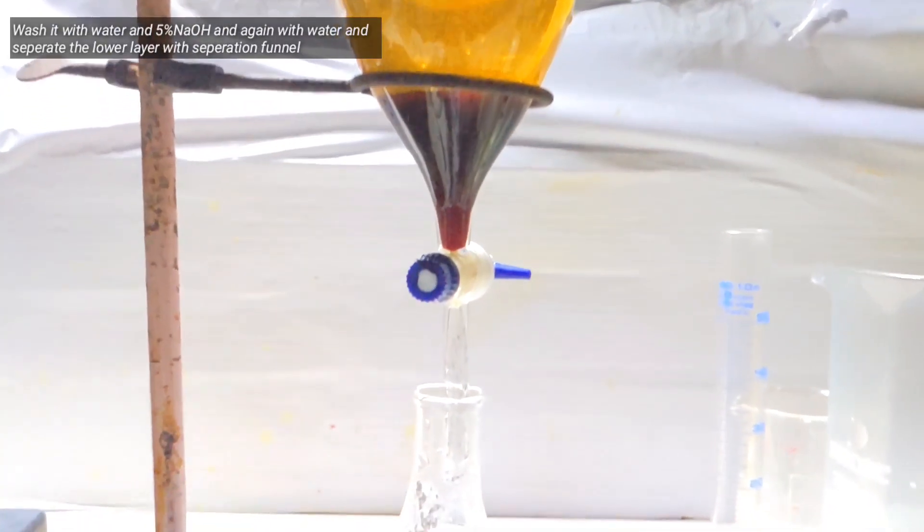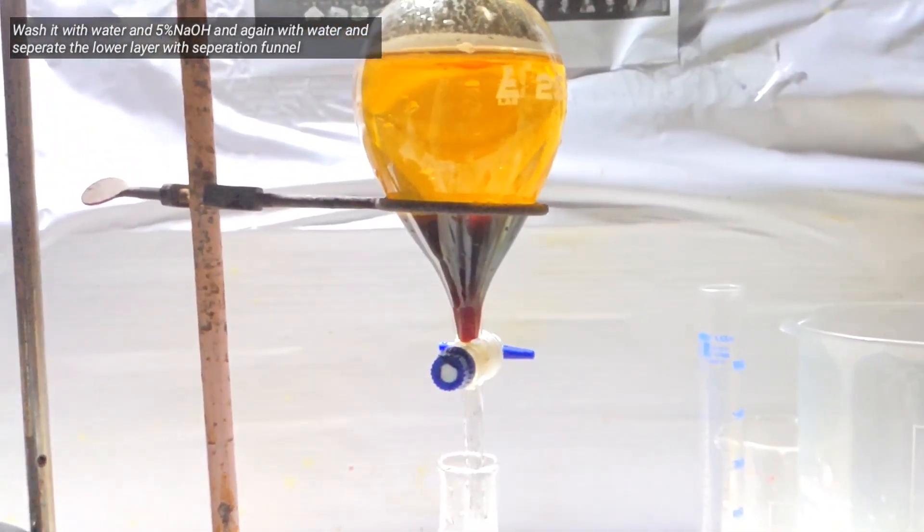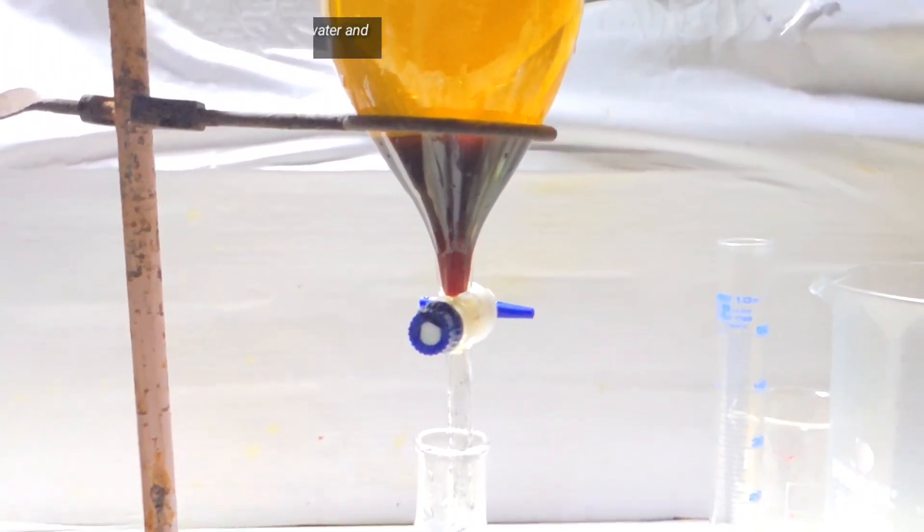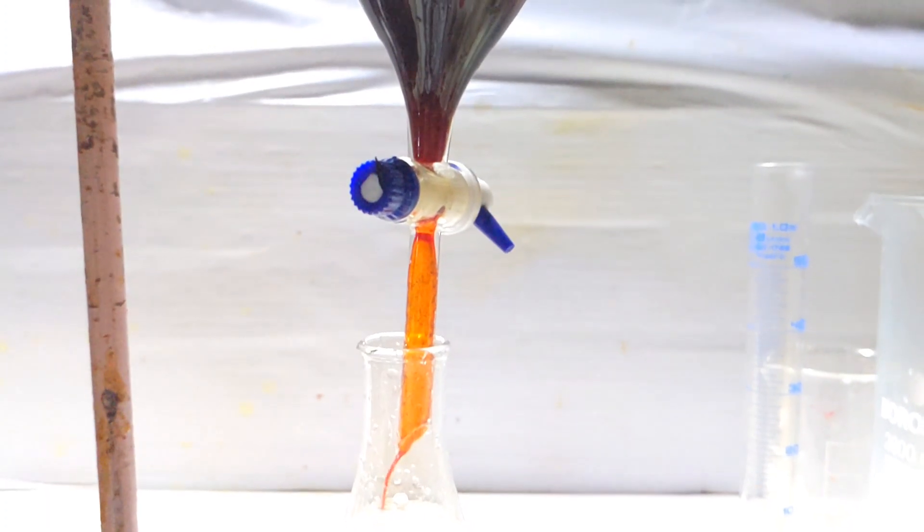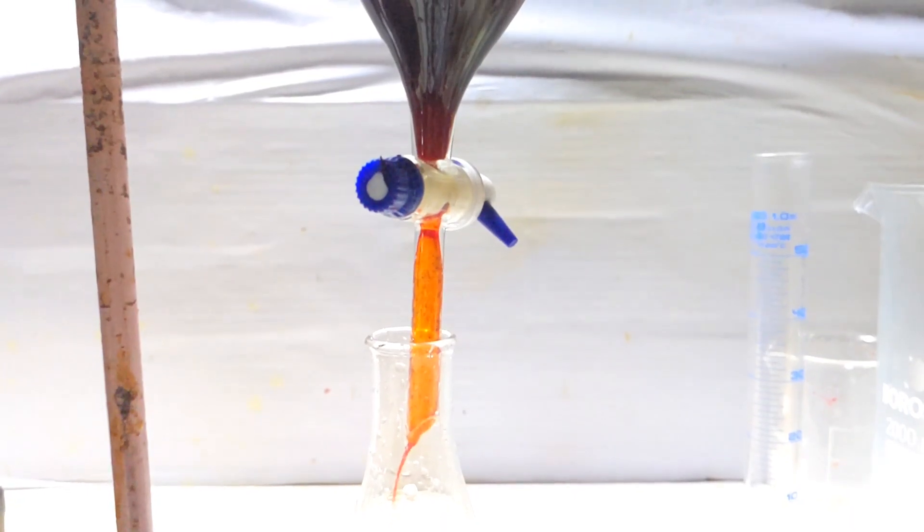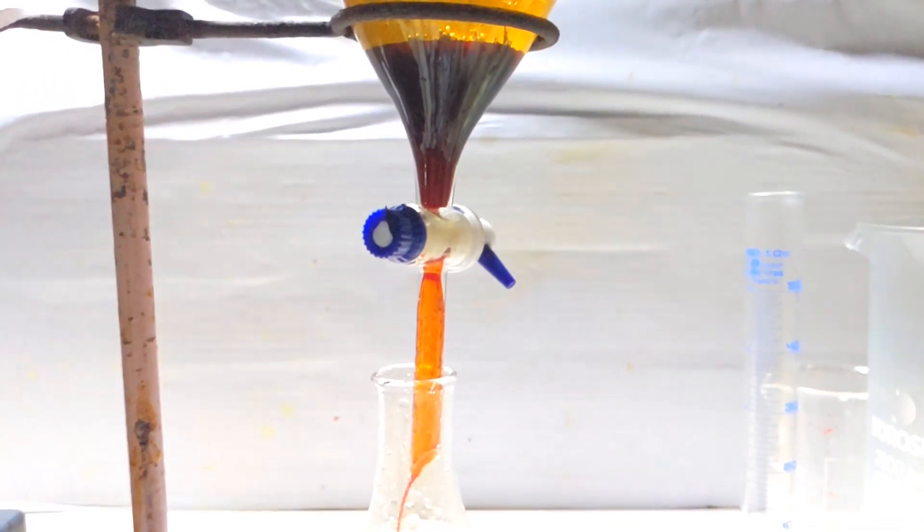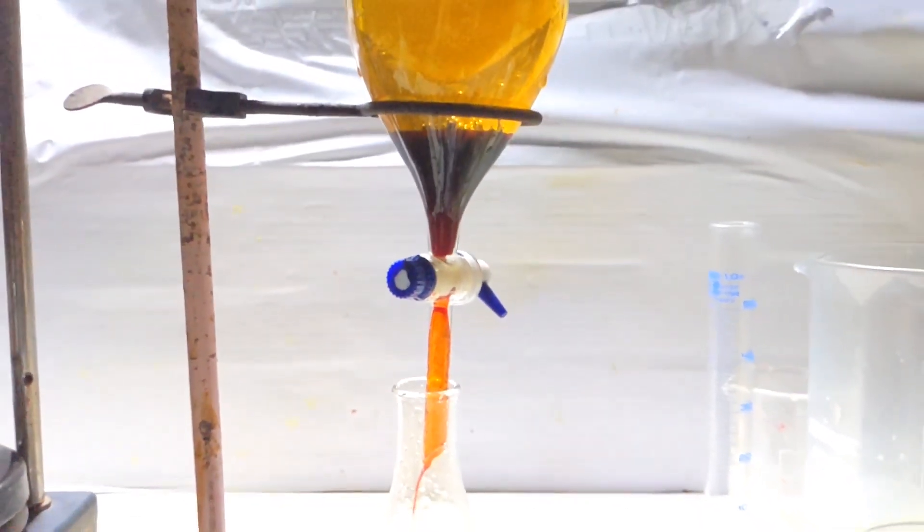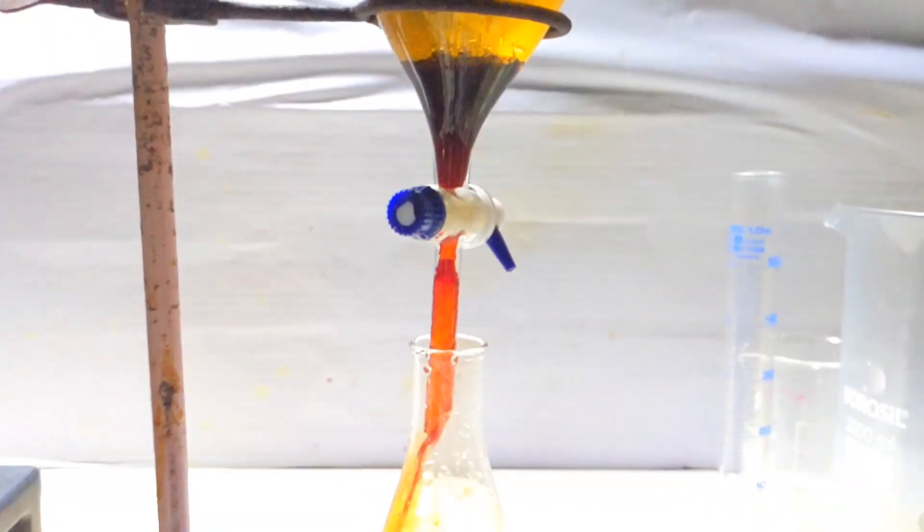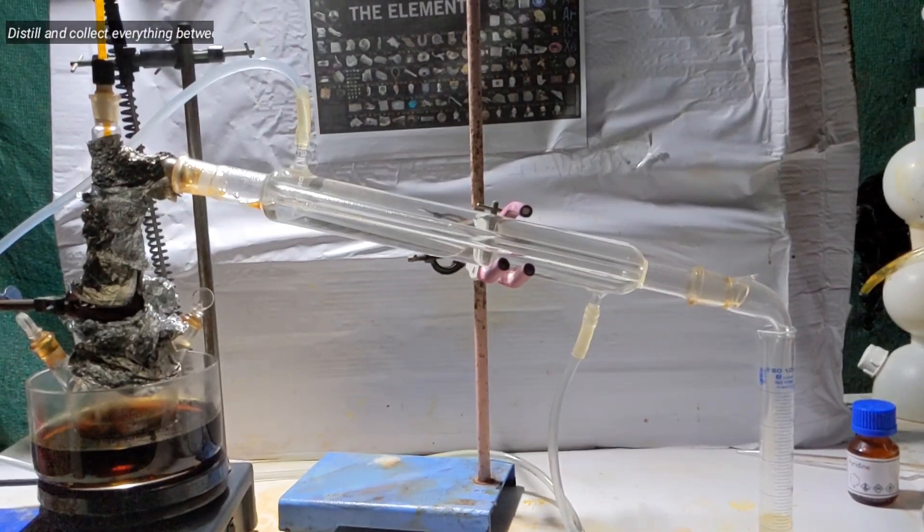After about 45 minutes, we pour the dark solution into around 200 ml of distilled water taken in a separatory funnel and shake and vent until all the unreacted excess bromine is removed. The crude bromobenzene settles to the bottom and is drained into a small 100 ml Erlenmeyer flask. This washing is repeated 2-3 times with distilled water and 5% sodium hydroxide solution.